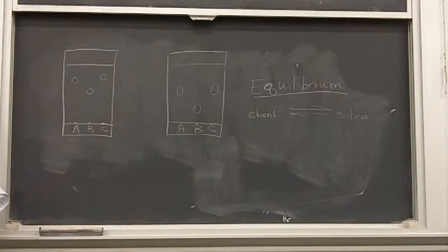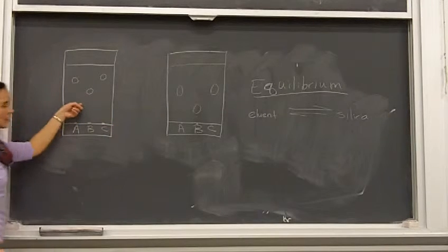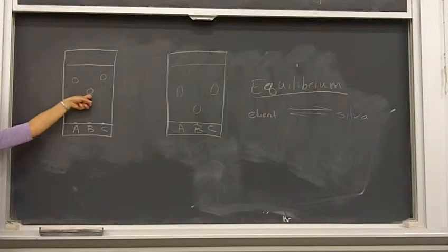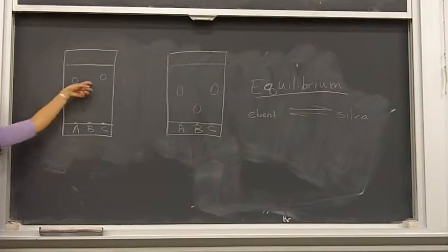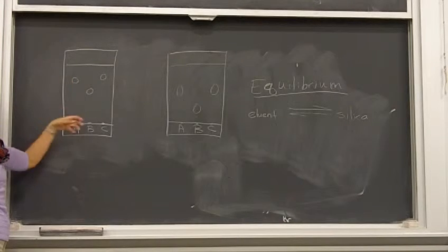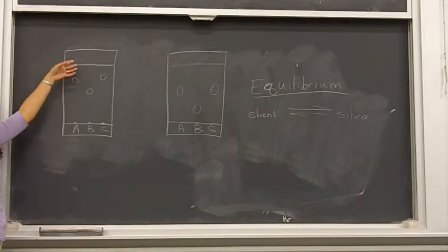Okay? What you would do to go from here to here is make that eluent more polar. And so by doing that, this more polar compound wants to hang out in the eluent more, and these compounds that are already hanging out in the eluent are hanging out even more in the eluent and traveling higher up the plate. Okay?